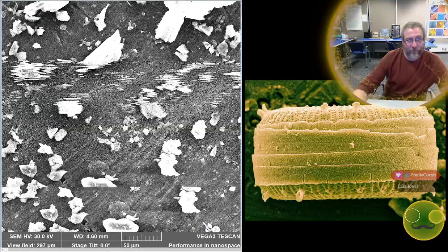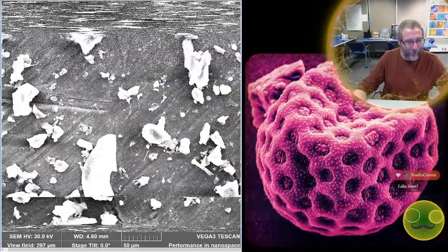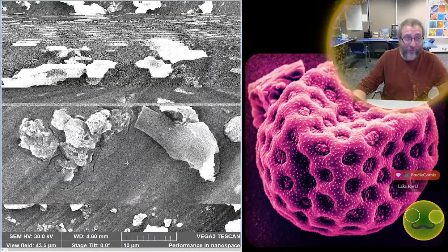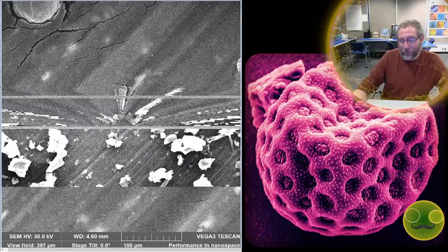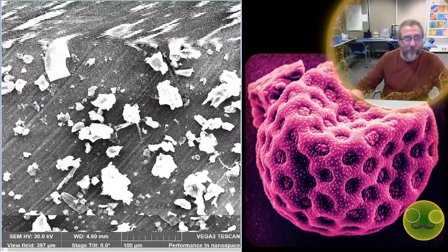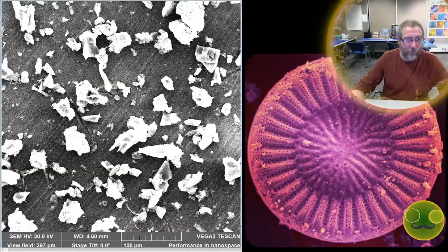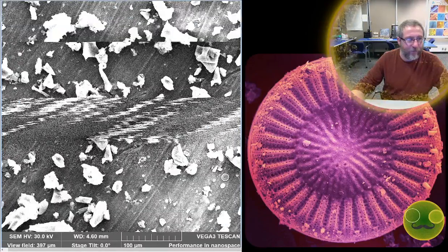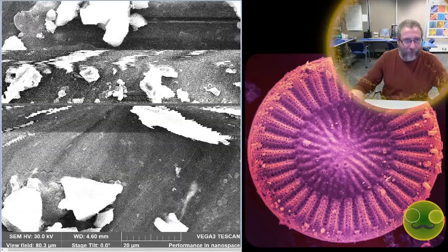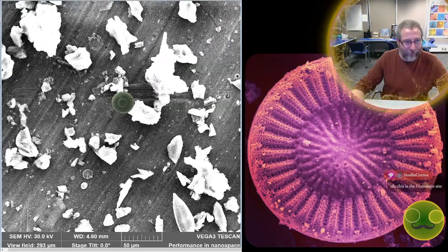But if you wanted to look at something like this kind of material, you could just go to your local hardware store and buy some diatomaceous earth and crush it up a little and sprinkle it into a microscope. And this is the kind of thing that you would probably see in that. Most diatomaceous earth that you find in the US, I think, comes from either this site or similar sites in terms of age. They're mostly Miocene or Pliocene in age, from around the U.S. where we just have, you know, extra diatomite laying around. And it's used for all kinds of things, as we've talked about on this channel before.